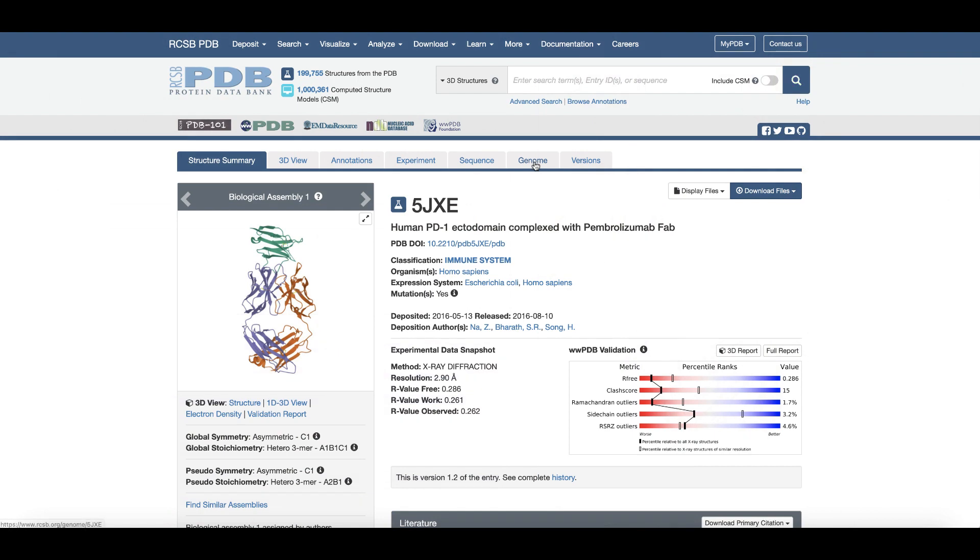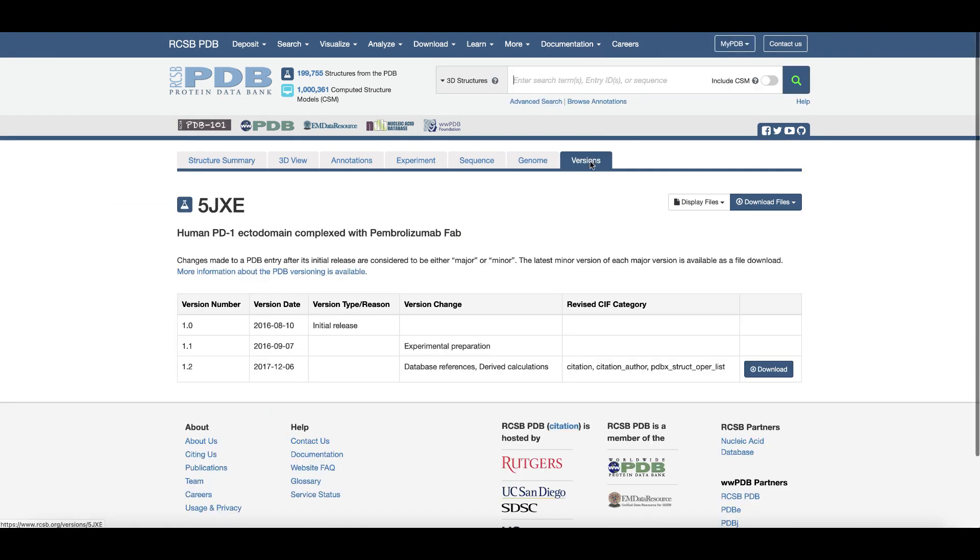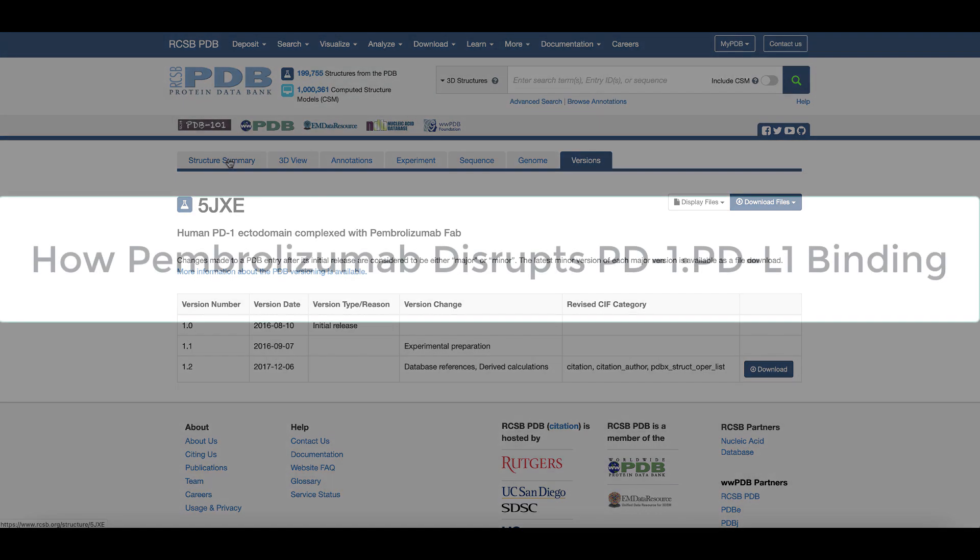The genome tab shows where the protein gene maps on the genome, while the versions tab lists the revision history of the structure.